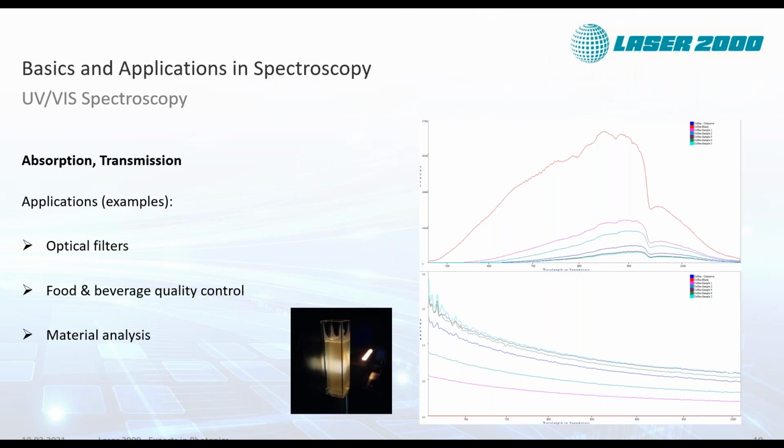Another point is definitely material analysis in the chemical and physical lab. This can also be a valuable technique when using other techniques like the following.